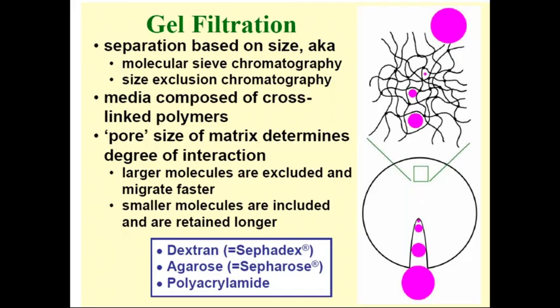And then you have size exclusion or gel filtration, where the separation is based on size because of the pores on the column material. So the small molecules enter the pores, the larger molecules remain in the interstitial spaces, they move along with the solvent, and the analytes get separated according to size, the big molecules coming out first and the small molecules at the end.